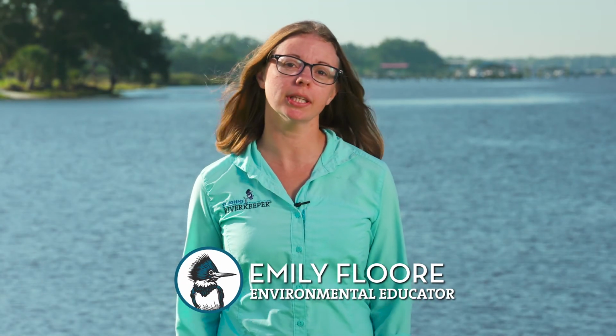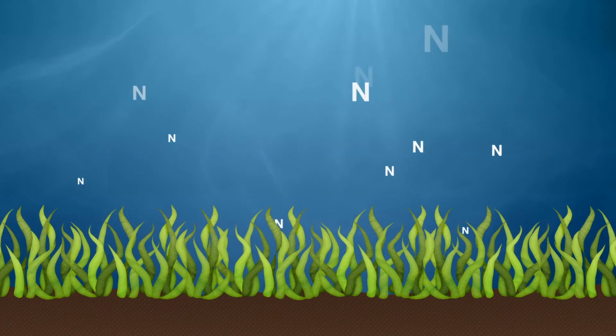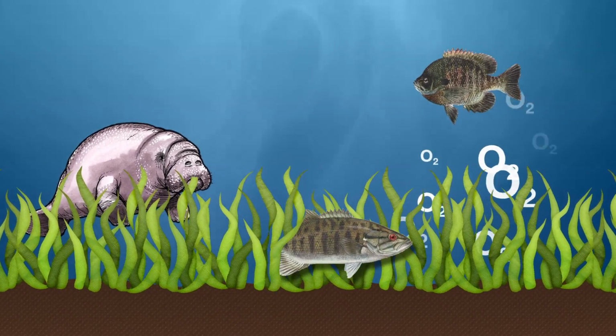Today we're going to be measuring the nitrogen levels of our St. Johns River. Nitrogen is a nutrient that plants need to grow. When nitrogen gets into the water, it feeds submerged aquatic vegetation, which then can provide food for herbivores, oxygen for gill breathers, and a habitat for many underwater creatures. The form of nitrogen we'll be testing for today is nitrates, as that's the form that plants use.